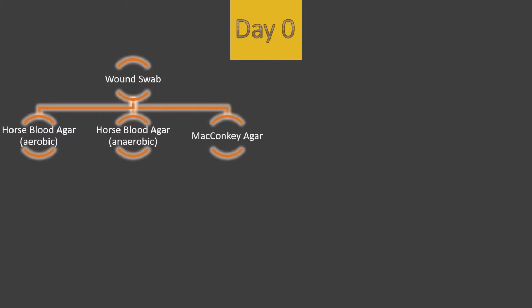On day 0, we cultured the wound swab on horse blood agar, aerobic and anaerobic, which is a non-selective medium to cultivate any fastidious and non-fastidious organisms with essential growth components and determine their hemolytic factors while considering their aerobic conditions.